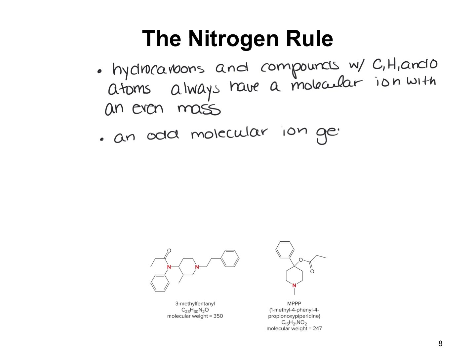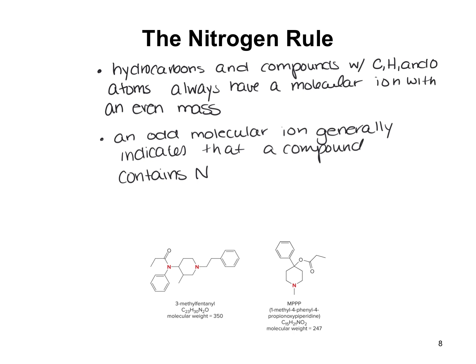Now, an odd molecular ion generally indicates that a compound contains nitrogen. Okay, this effect is called the nitrogen rule, right?